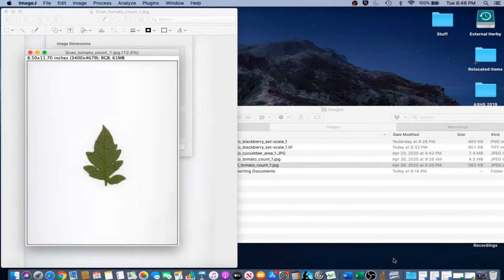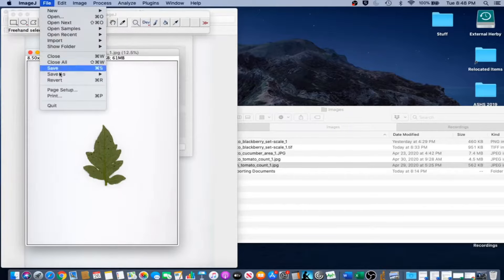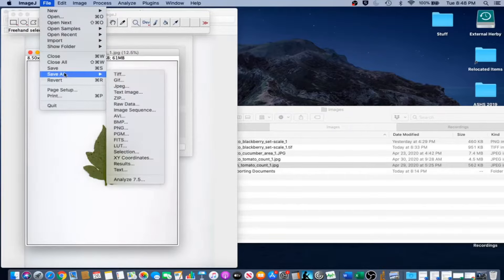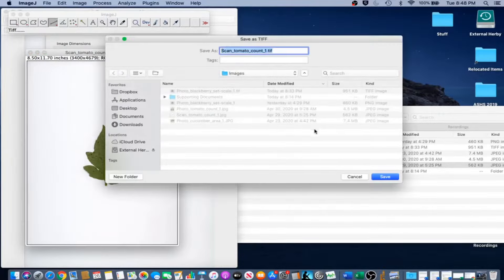Now our image is scaled and we are going to go ahead and save a copy of that scaled image. Go to File, Save As, TIFF, and go ahead and save.